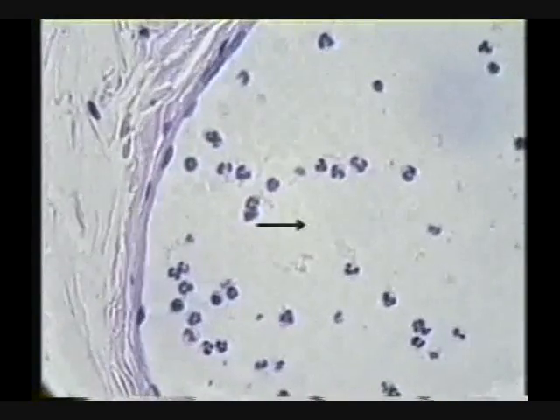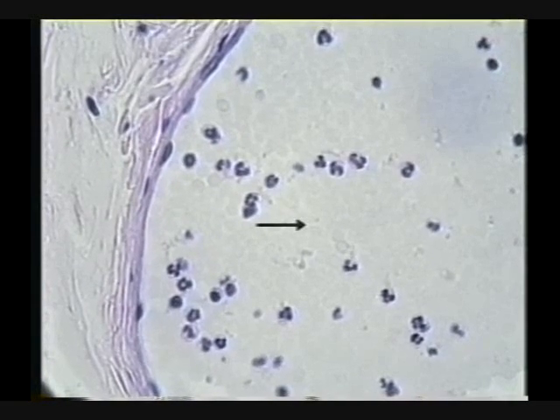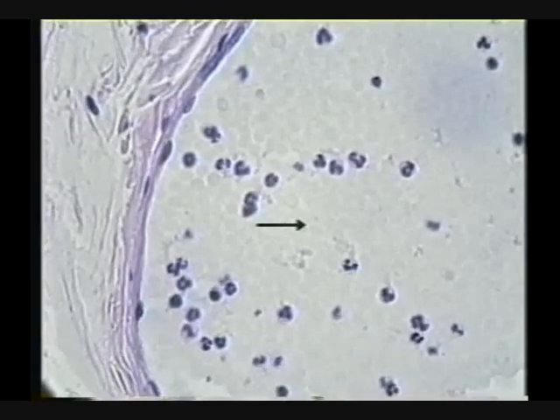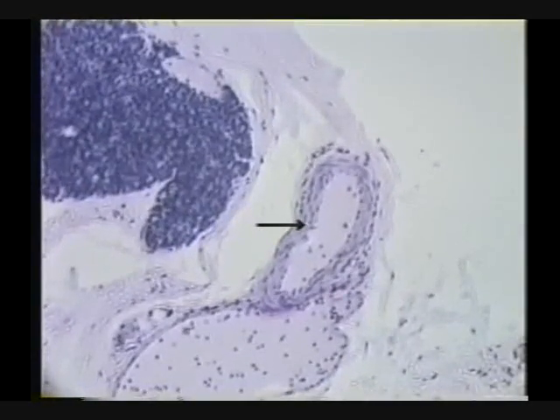And I come on out. Whoa, what am I in there? Must be a vein. Look at all the white cells in there. A lot of white cells and little red cells. Go to the lower power. Yeah, nice big vein I ran into. And there's its associated artery. Good. Organ?